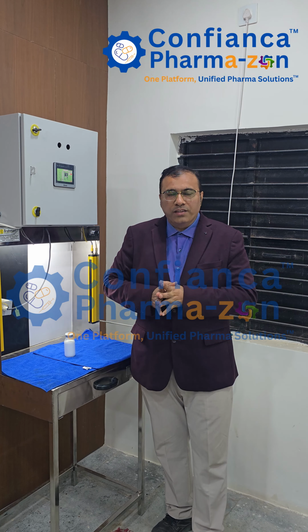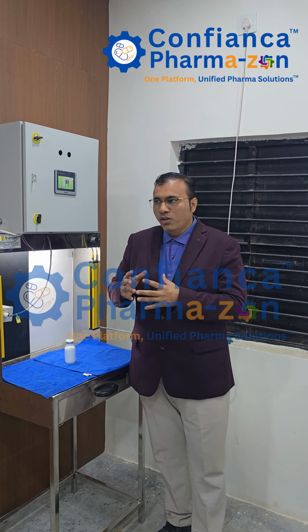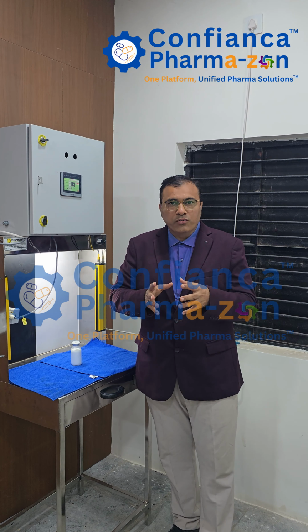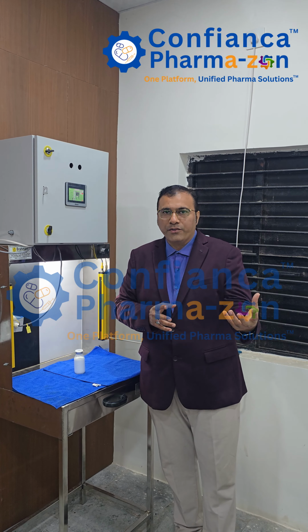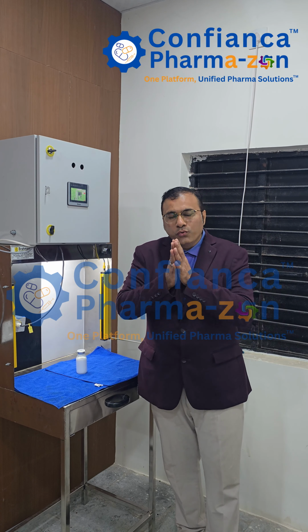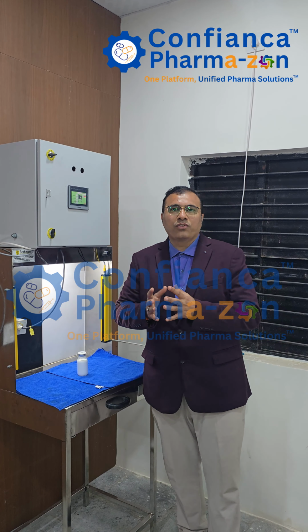I want to ask you one thing: do you really feel that certain 483s come because you are manually checking the entire lux values? The lux values are checked manually and written manually. If there are issues in writing, or some issue occurs in the LED or the lux after you start your operation, then what will happen? You will get a non-compliance, and that non-compliance leads to a 483.